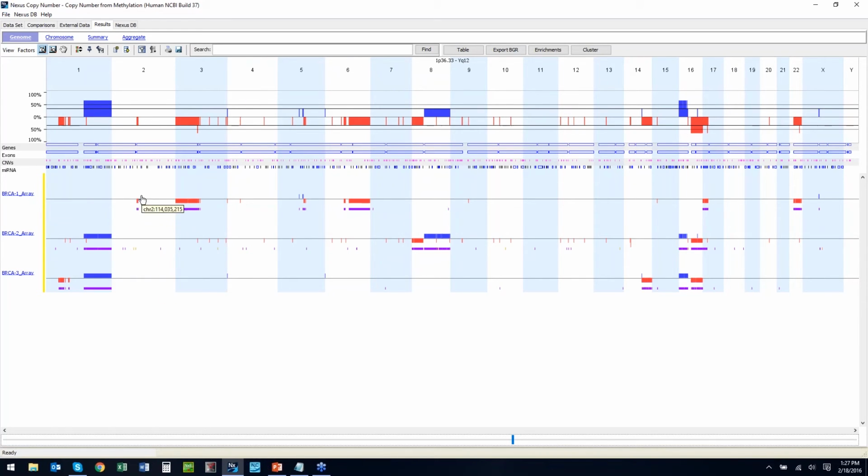You can see that in addition to having our copy number profiles here, we also have B allele frequency information. That's because the SNP probes do also offer us allelic information, so we're able to see if we have any areas that have allelic imbalance or loss of heterozygosity, changes in the allele frequency. You can see that we have both large changes covering chromosome arms, whole chromosomes, large portions of chromosomes, as well as some smaller changes that might be on the order of several kb or megabases. And they really vary widely in terms of their size.